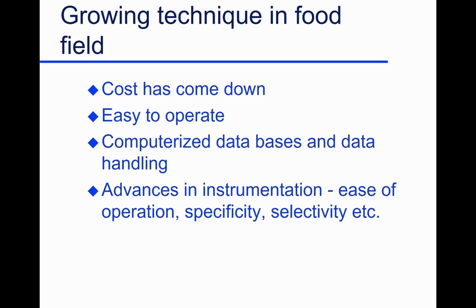And what makes this possible is we can resolve the composition here versus here within 20 nanometers. We have 20 nanometer resolution of this, which is just fantastic. All brought to us by creative scientists. Because a fun thing about the food business, we get to use everybody else's stuff. They come up with some good ideas. We get to put it to practice.